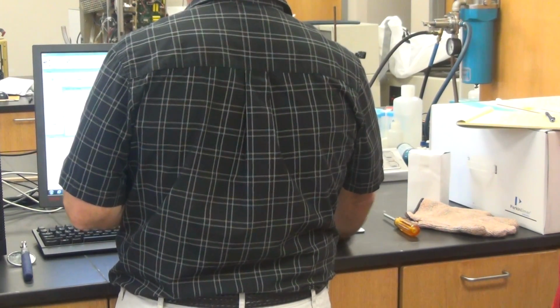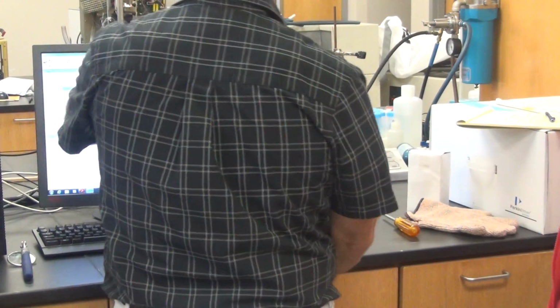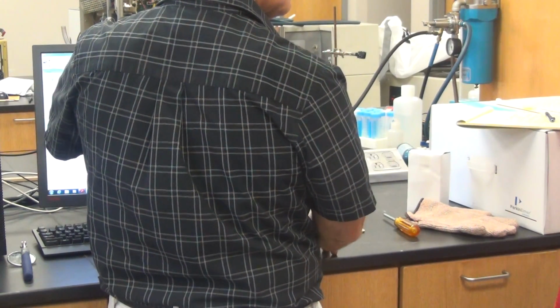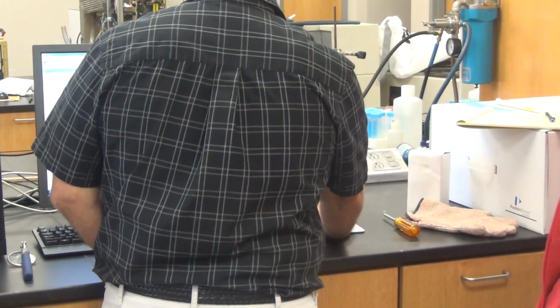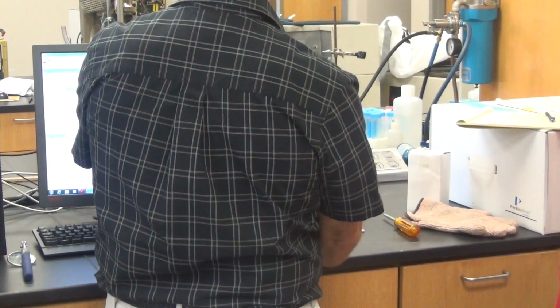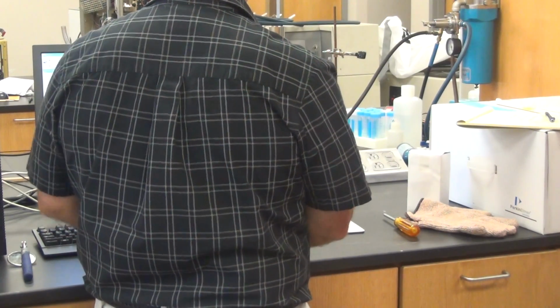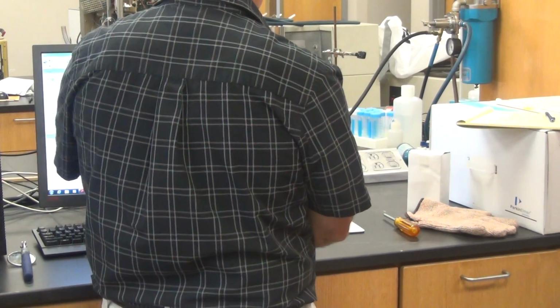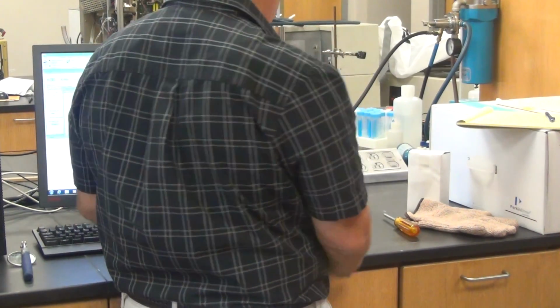And then this is just like the other. How many standards, you know, and the only thing it's going to say is, what's your stop? If you're letting the software make the dilutions, what's your stop? That's the difference. And you can calculate the dilution so you don't have to put it in there. So that's a window for that. I want to use stock solution 1 and it's a 20, and then I tell it what the actual concentration is, and it will do the math for you.